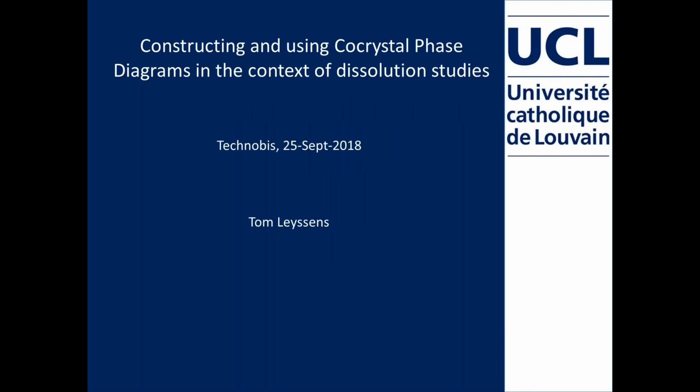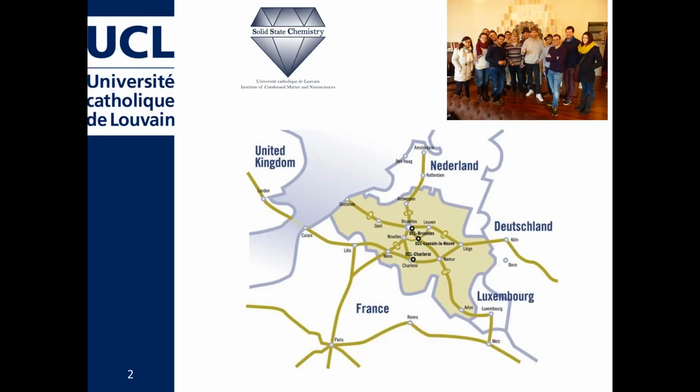As Carmen just mentioned, today I'm going to talk about co-crystal phase diagrams and how we can actually use those diagrams in the context of dissolution studies, so to understand dissolution studies. I will mainly focus on pharmaceutical compounds because that's what I do and that's where I come from.